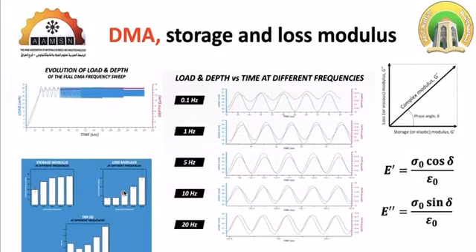Okay, so they bring this case to nano indentation, mimic it inside the nano indentation, apply the DMA test, and they found that with increasing the applied load or the speed of the vehicle, both loss modulus and storage modulus increase.